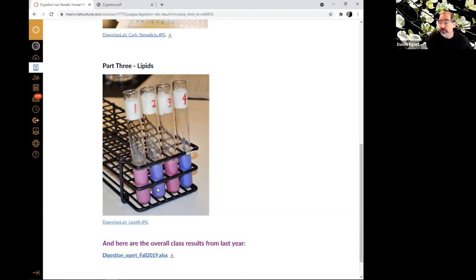It's not even like purple. It's more blue, right? If it was turning purple, then it would be more evidence that there is breakdown. There's a slight discoloration compared to 4. I think that's more because bile salts themselves are kind of yellowish and they're going to discolor things a bit. But if you genuinely thought this was getting more pinky purple, then you would have to say there's maybe some breakdown. If you just think it's blue, maybe with a little bit of discoloration from the yellow-brownish bile salts, which is more what I think is going on, then it wouldn't be breakdown.